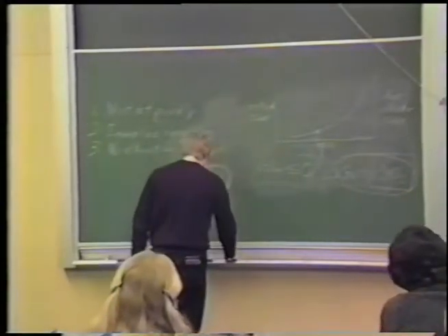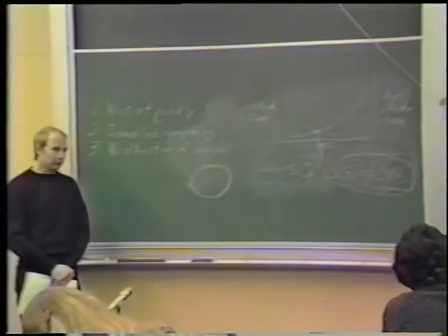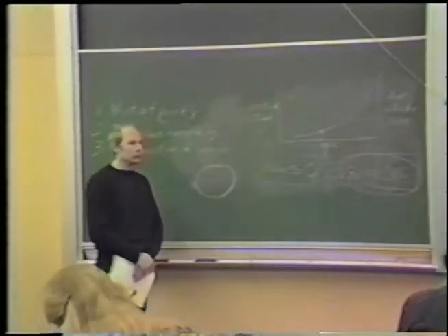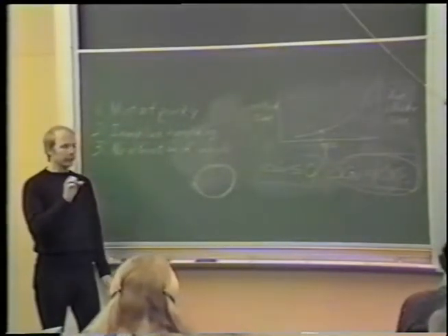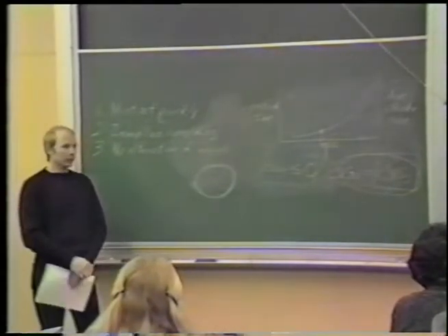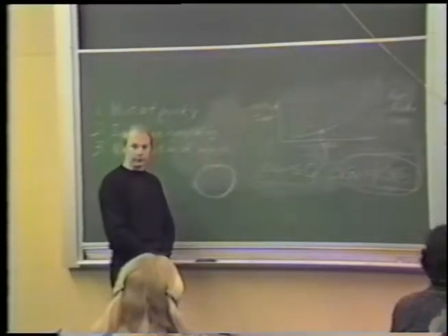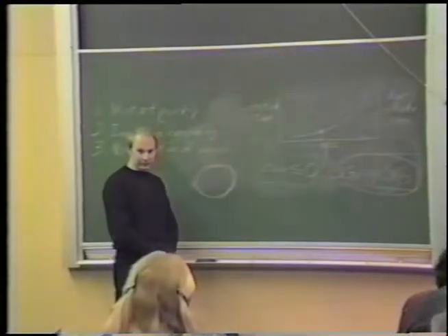Now, it is possible under very special conditions to vitrify very tiny portions of samples or very tiny samples. 300 nanometer or so layers on a substrate can be vitrified by dipping into cryogen, for example. Or tiny droplets, 1 micron diameter droplets suspended in a conductive medium, can be vitrified if they're in a thin layer and cooled rapidly. But none of the techniques for which true vitrification, with no ordered domains, has been demonstrated are suitable for preparation of biological samples as yet.